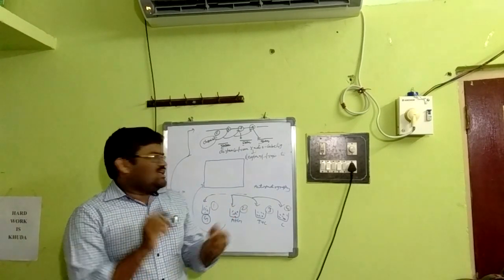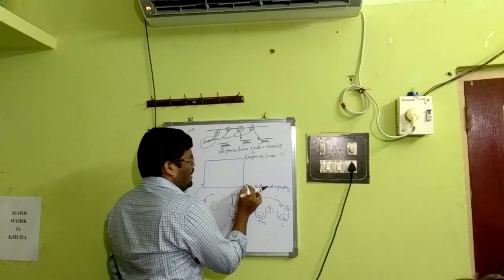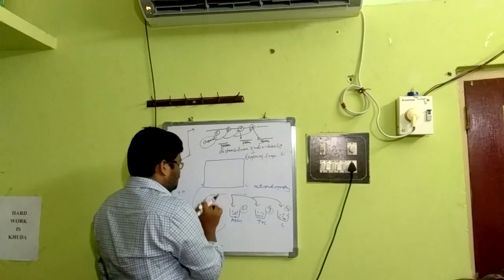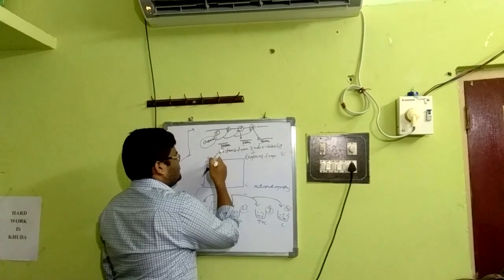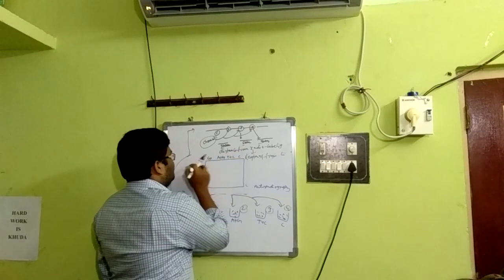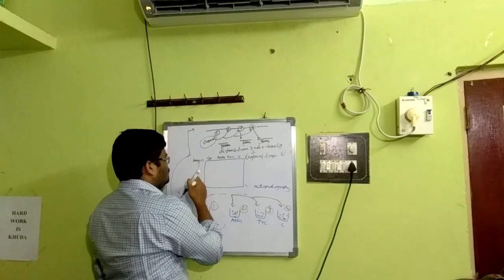How? Say, for example, different bands. It's a complementary sequence. We have to read from the bottom. Say C, then G, A plus G, T plus C, then C. Here it goes from longer fragment to shorter.